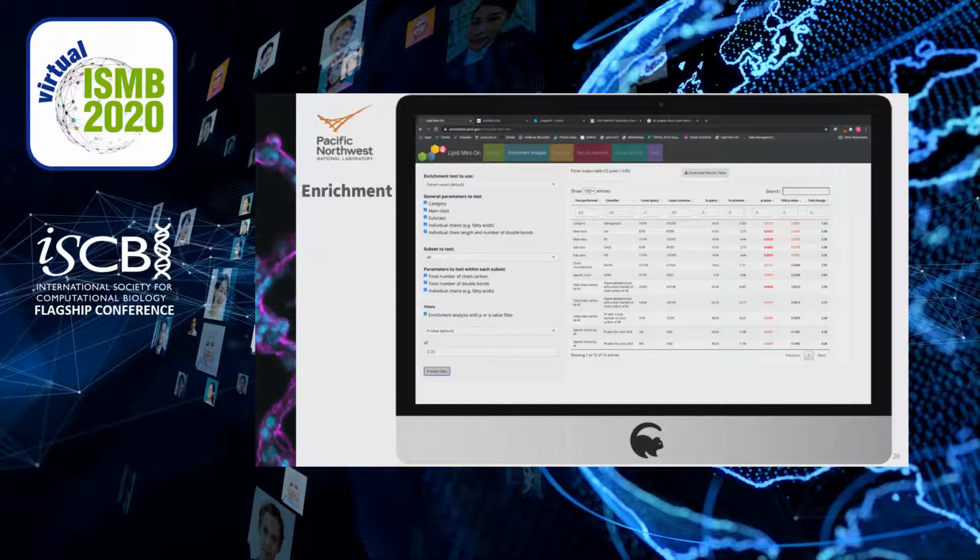We filtered the results to show only the lipid ontology bins with a p-value below 0.05. As you can see, in the endothelial cells, the sphingolipids were enriched, and in particular ceramides, as well as the phosphatidylserines and the lipids with very long fatty acid chains, or the PIs with the specific chain 20:4.